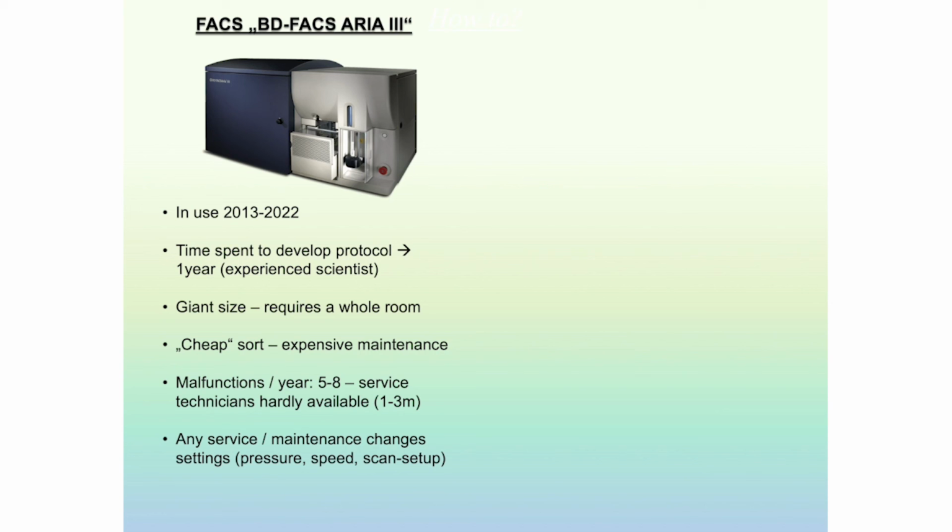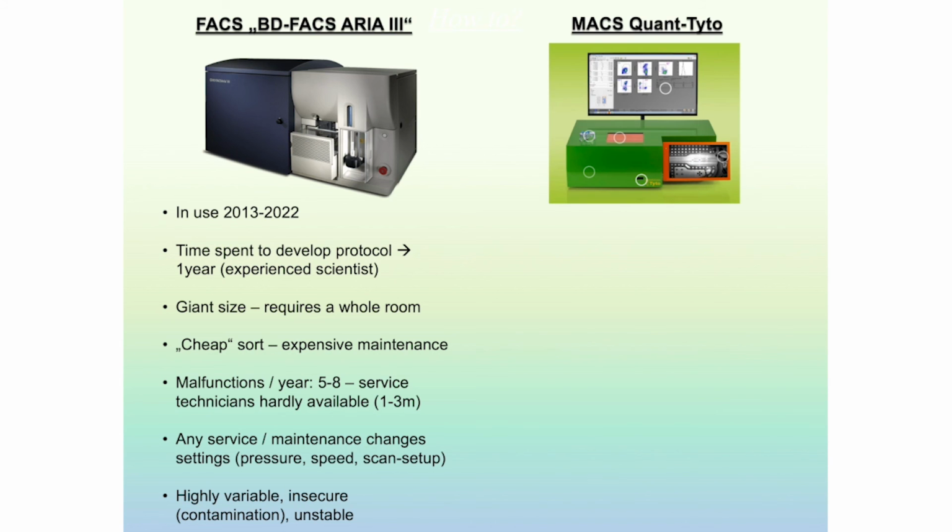is then not comparable anymore, and I have to adjust the settings time and time again. So in my experience, it's highly variable, insecure in terms of contamination, and it's unstable, which might not be a problem for cell lines, but for neurons it is.